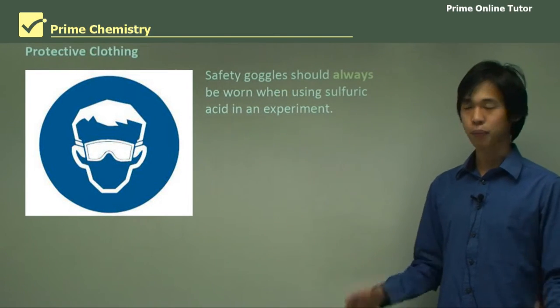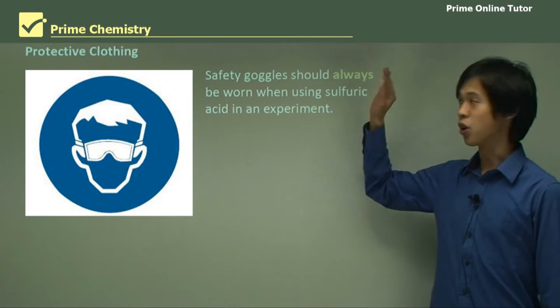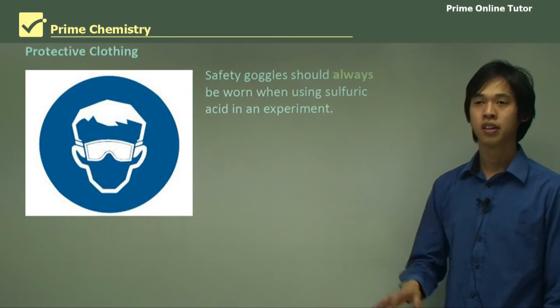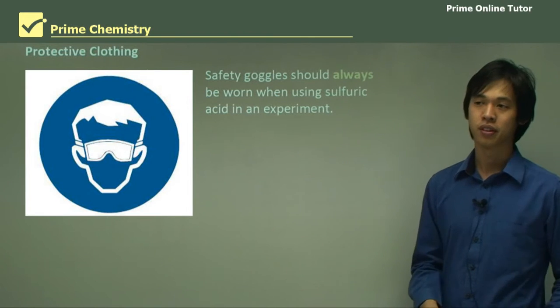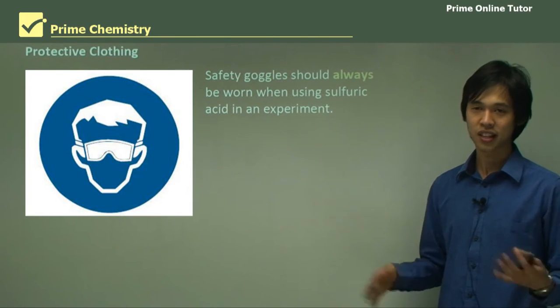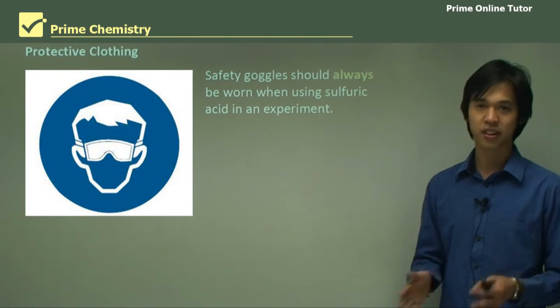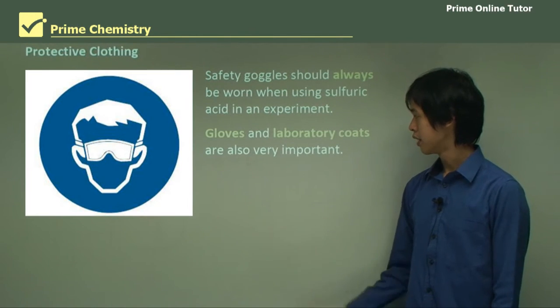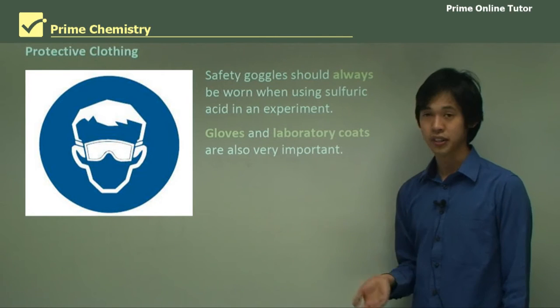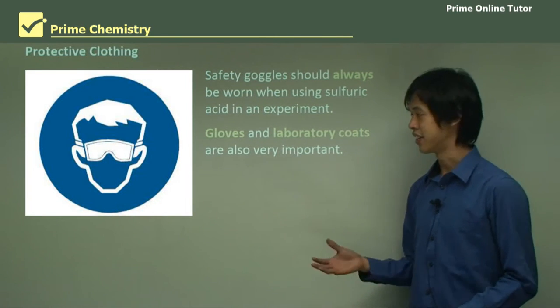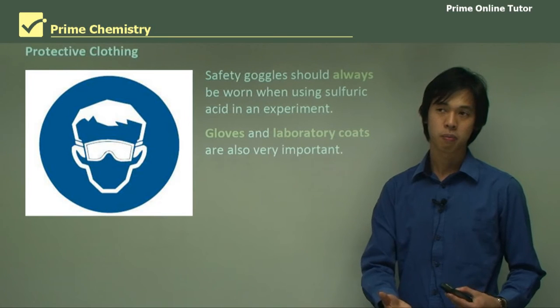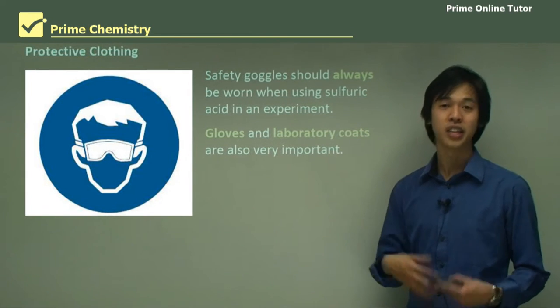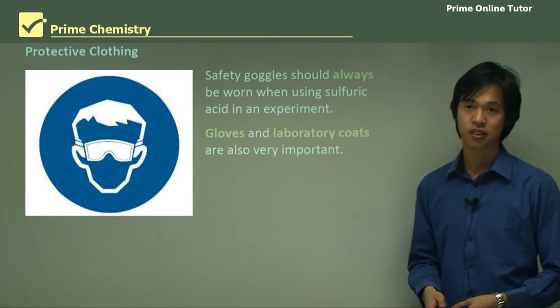So the first thing is protective clothing. Safety goggles should always be worn when using sulfuric acid in an experiment. Safety goggles have to be worn — there's no exception to this rule. You have to wear safety goggles when dealing with sulfuric acid. Gloves and lab coats are also really important. There is no way around this; you need to be wearing these things when you deal with sulfuric acid.